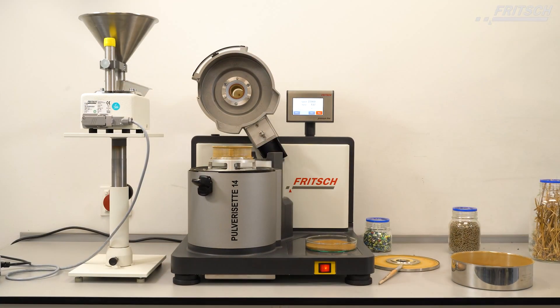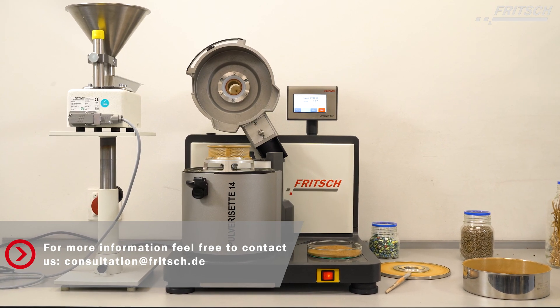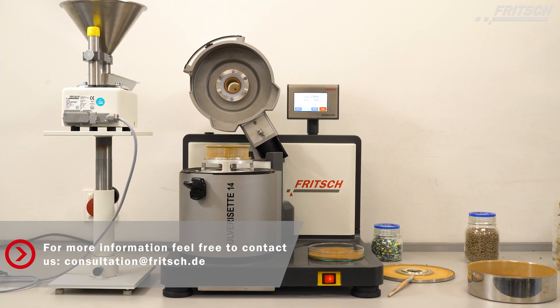The Fritsch Vibratory Feeder Labourette 24 and the Fritsch Pulverisette 14 Premium line are a perfect match for even your most challenging applications.